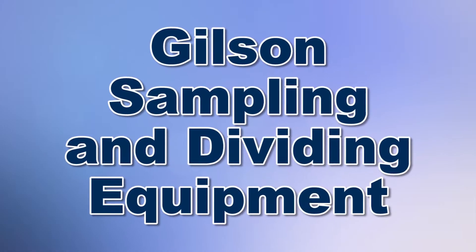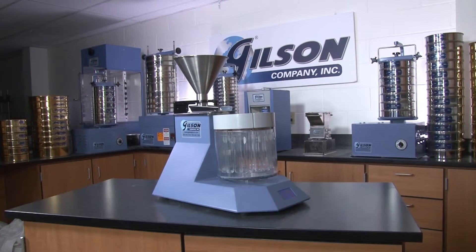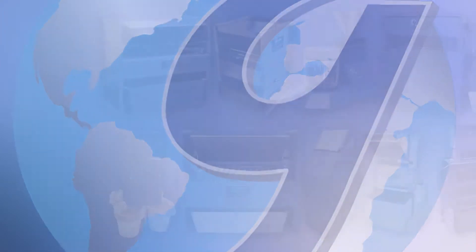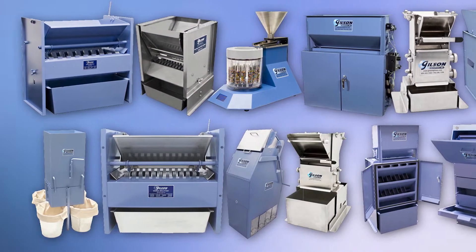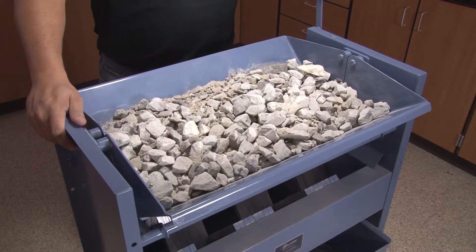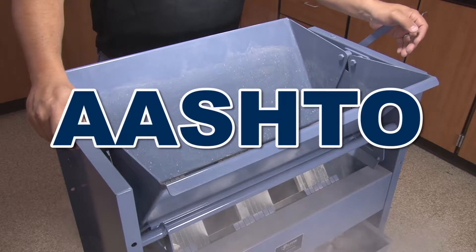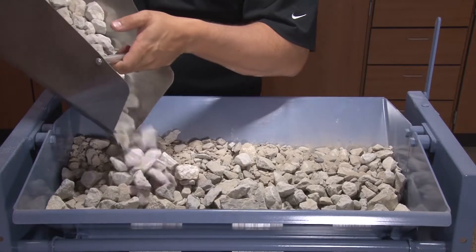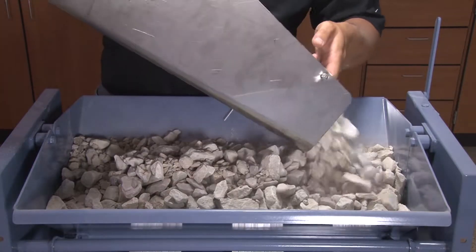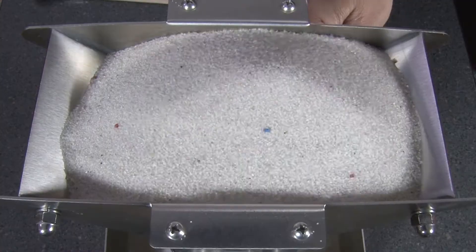When you need to accurately perform particle sampling operations, Gilson is your best choice. Gilson has everything you need to divide any bulk sample, ensuring that your sample dividing is compliant with ASTM and AASHTO standards. Gilson's variety of sample splitters and dividers are designed for particle sampling from large coarse aggregates to fine powders.